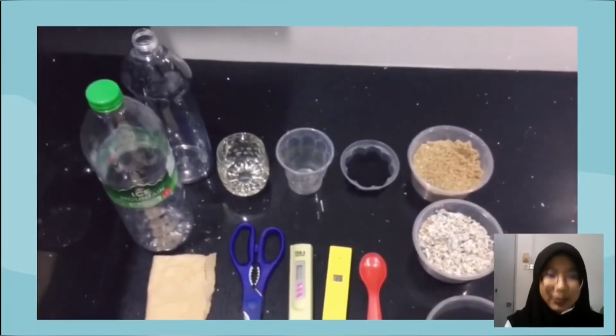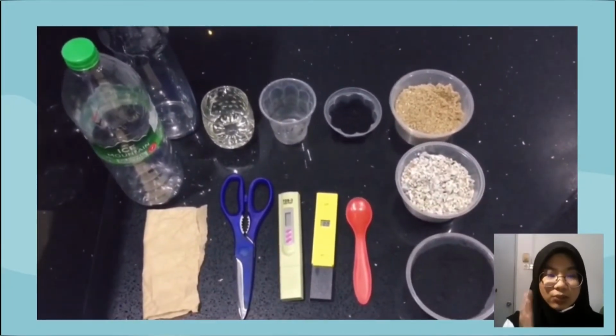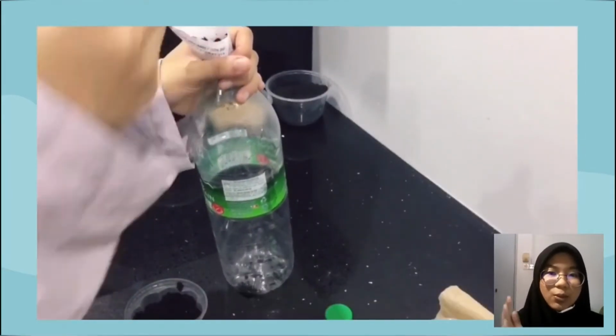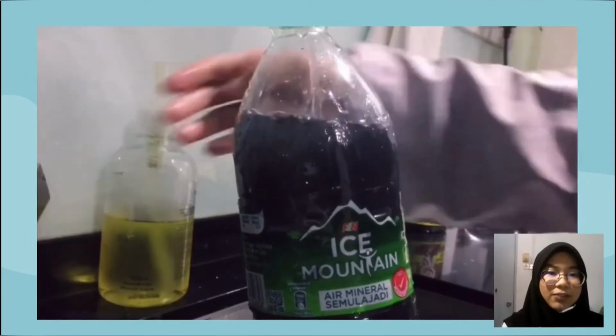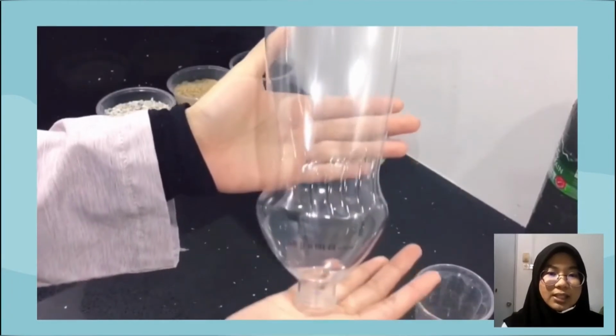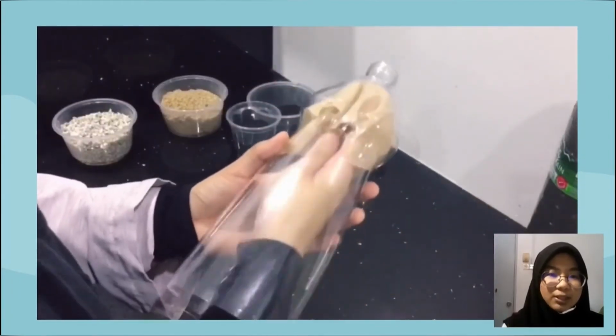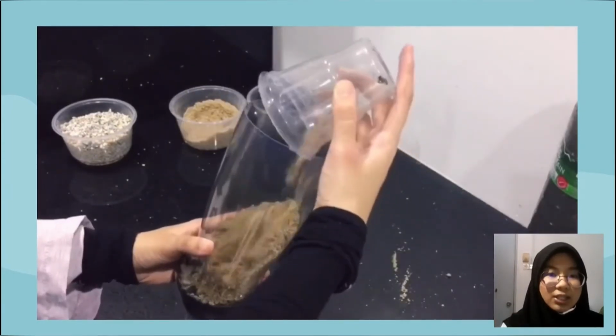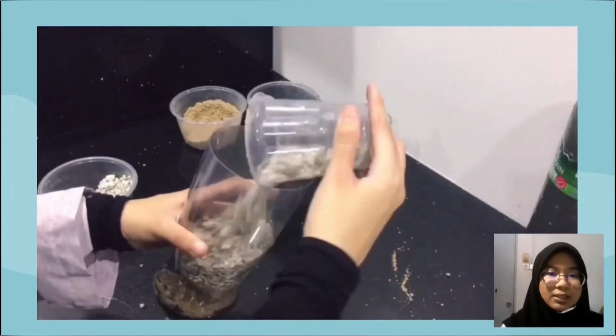To prepare the water filter, you will need some materials, which are soil, sand, pebbles, and also charcoal. As for the apparatus, we need 2 bottles, cups, a pH meter, a TDS and temperature meter, and also some cloth. To prepare the water sample, you will need 1 tablespoon of soil and 1.5 liters of tap water. To prepare the water filter, cut down the bottom of the bottle, put the cloth to avoid materials going out from the bottle, and pour in the charcoal, sand, and pebbles layer by layer.